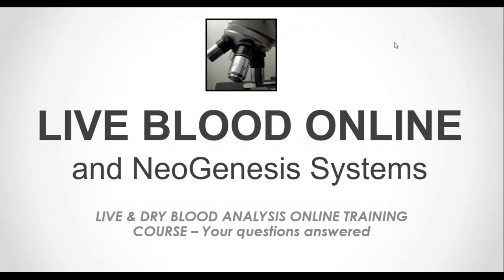All right, well, this is actually quite an important question. There are a few very important things to look for. So one of the most important features, and also one of the potential pitfalls for attendees, is that not all microscopes or so-called dark field microscopes are actually suitable for live blood analysis. So one of the most important features to look for that actually sets proper dark field live blood analysis microscopes apart from other microscopes is its ability to do dark field analysis properly.